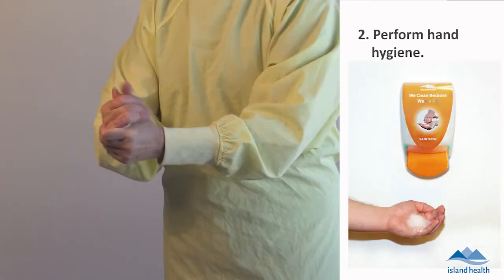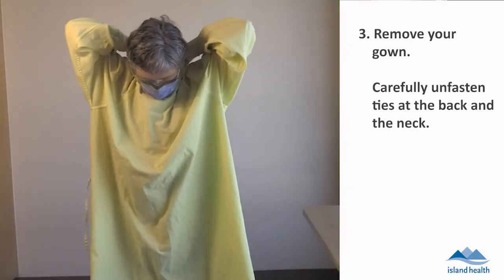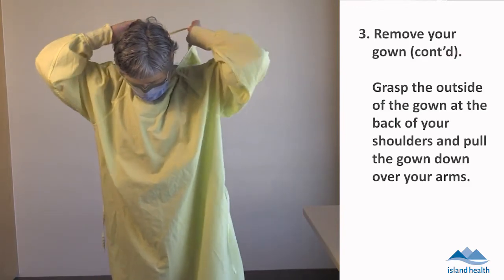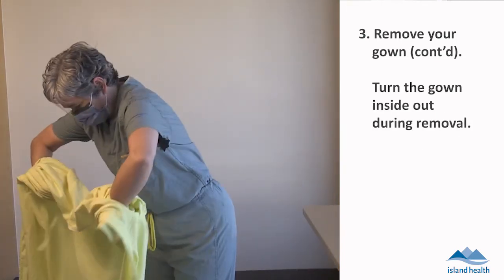Perform hand hygiene. Remove your gown. Carefully unfasten ties at the back and the neck. Grasp the outside of the gown at the back of your shoulders and pull the gown down over your arms. Turn the gown inside out during removal.